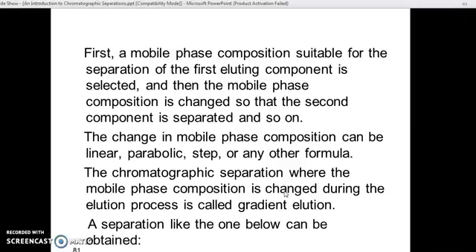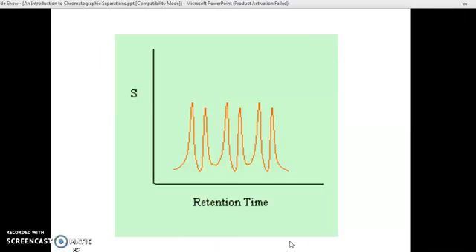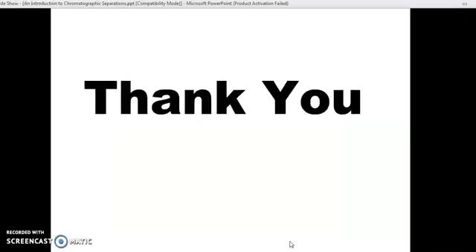We say how the composition of different types of solvents we get together and finalize the mobile phase. But before finalizing the mobile phase, the composition you are concerned with is linear, parabolic and stepwise, and whatever you finalize you have to check the pH, because you need to get interaction, whatever further you are designing, to check out the buffer systems. So this is the retention time.